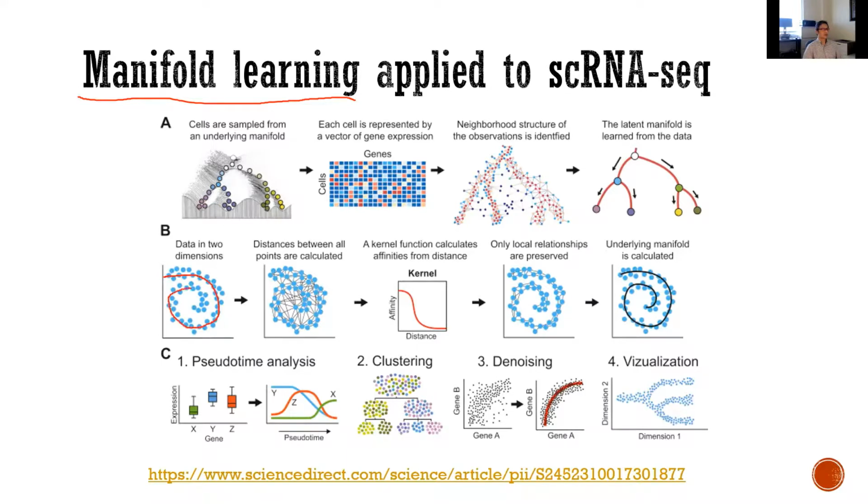In this case, if you have a global view of where the data points are distributed, you will have this structure here. However, if you compare, say, 2 data points, one from here and another here, and you don't have this manifold structure in mind with a global distribution of your data points, you only look at the distance between the 2 data points.